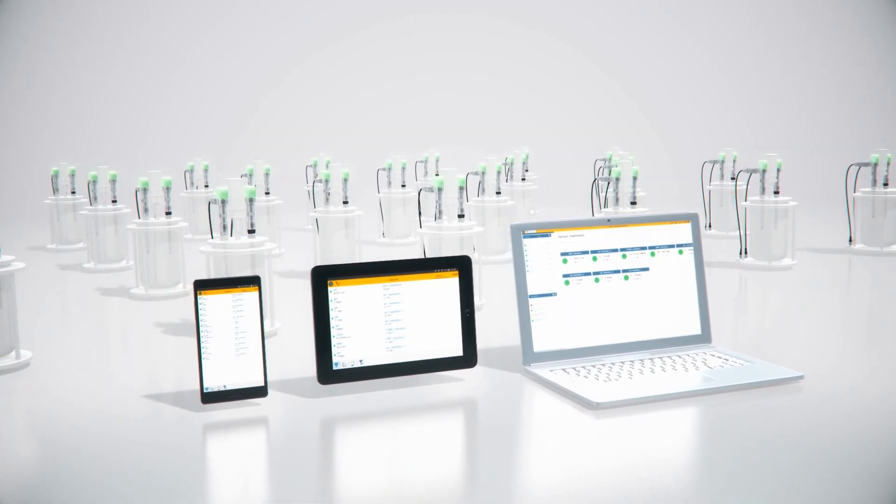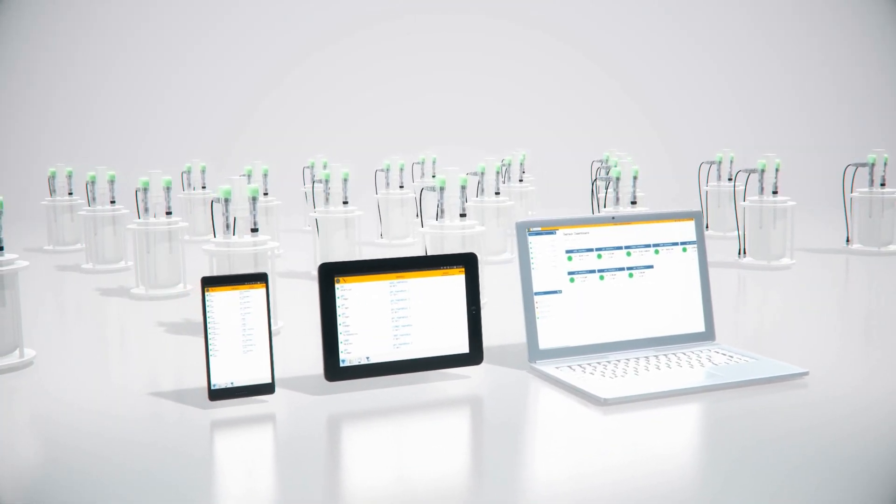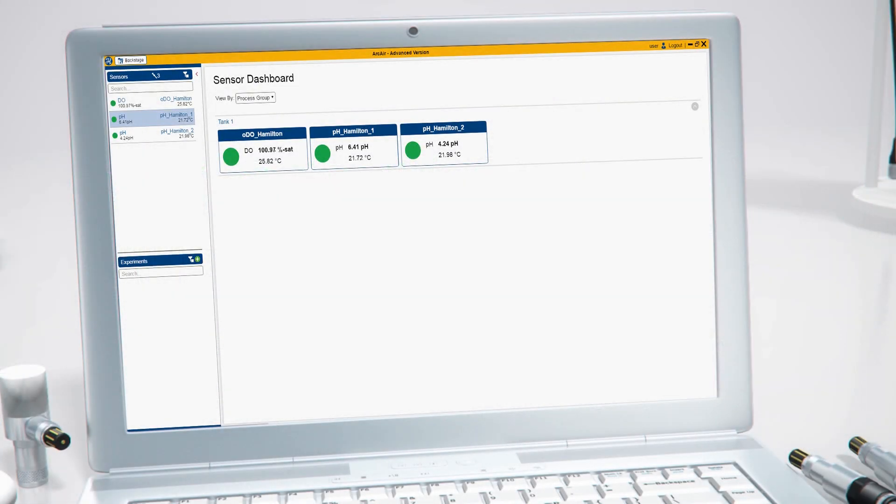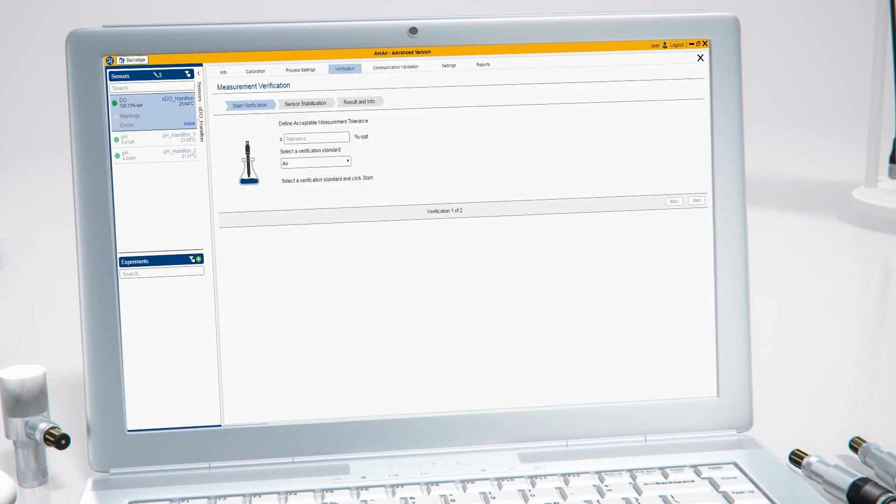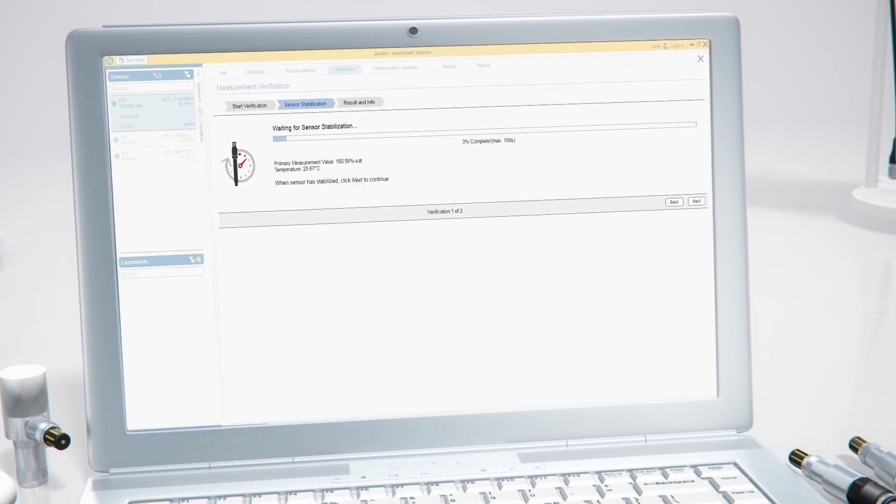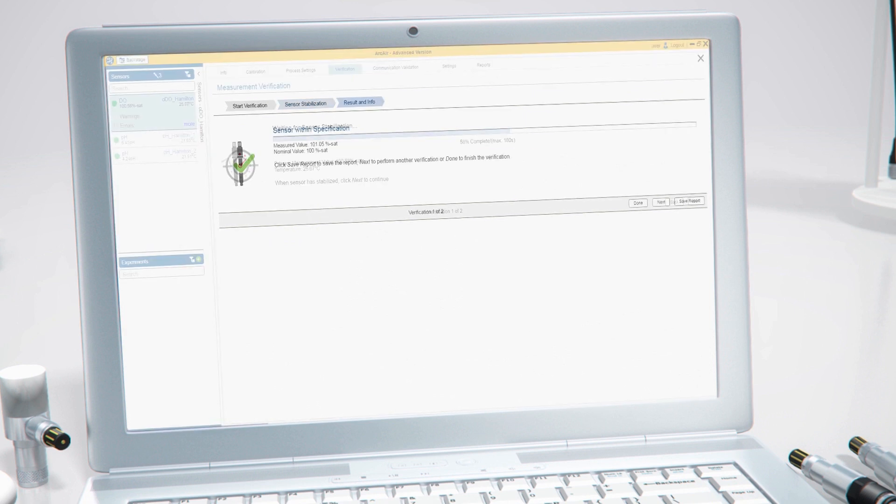After fermentation, sensor measurement performance needs to be checked. Measurement verification is required to ensure the accuracy according to the process specification. ArcAir software provides a simple wizard to guide you through these steps.